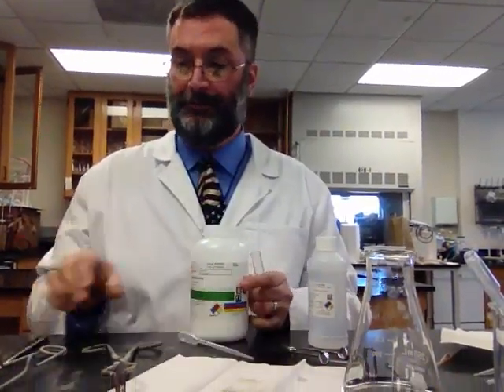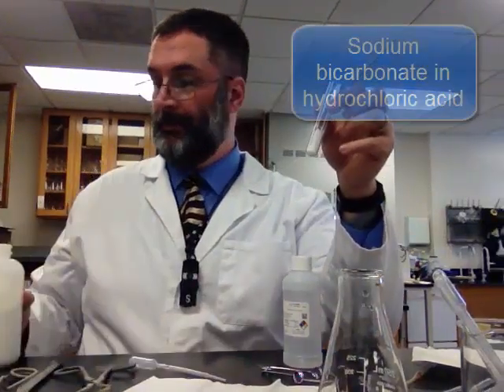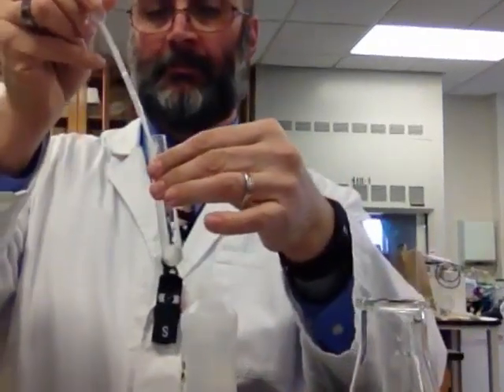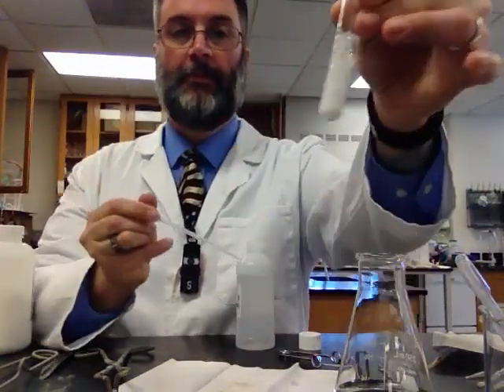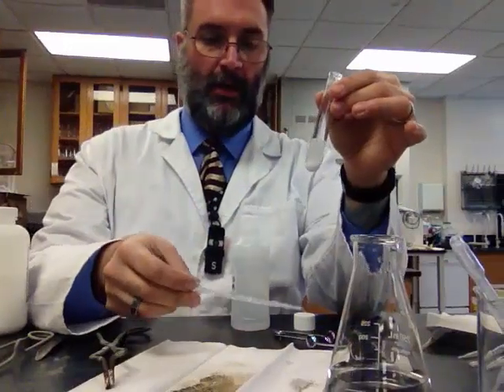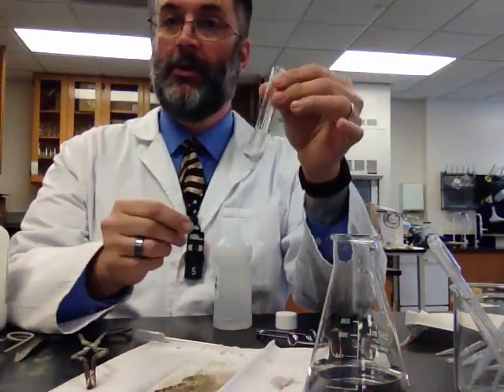Next one, sodium bicarbonate. Sodium bicarbonate is a white powder, commonly known as baking soda. You probably have this in your kitchen. Hydrochloric acid. Pretty obvious change there. Watch again. Right. There's a pretty clear something happening every time I add the acid. The other thing that's interesting about this is the test tube has gotten very, very cold to the touch. That's another thing that's very important.